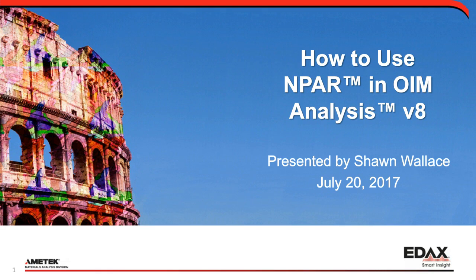Hello, everybody. It's nice to be here with you to share how to use NPAR in OIM Analysis. It's changed a lot of things in my workflow, and I wanted to make sure you understand how to use it, how we use it in-house, and to better explain the functions inside of it and how they go with your workflow.